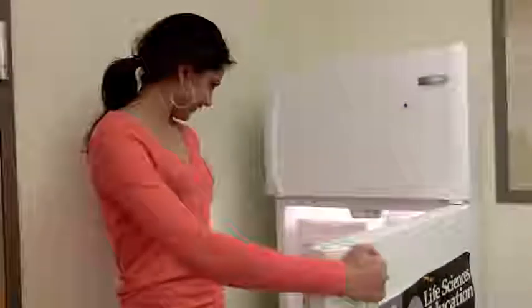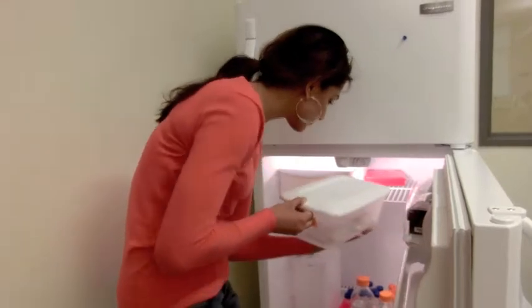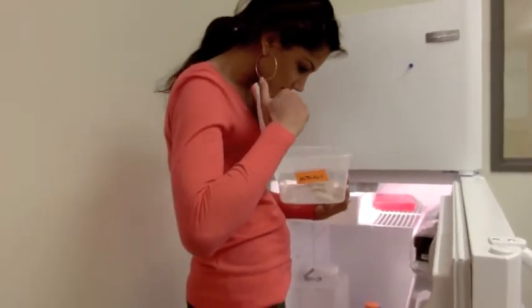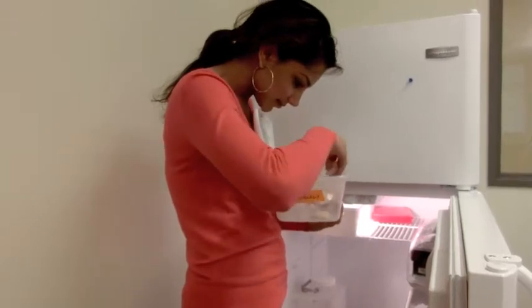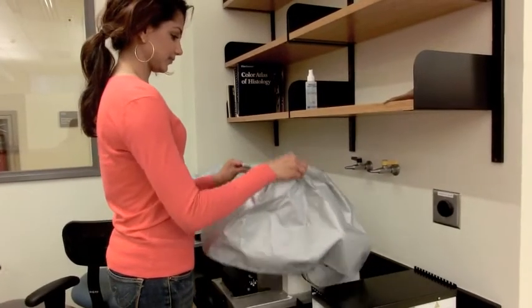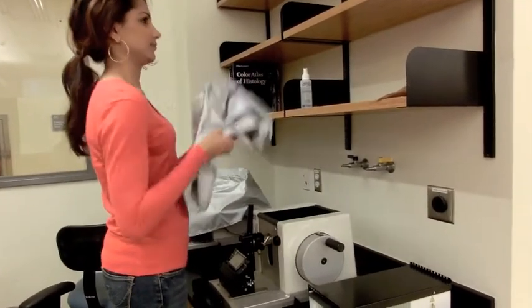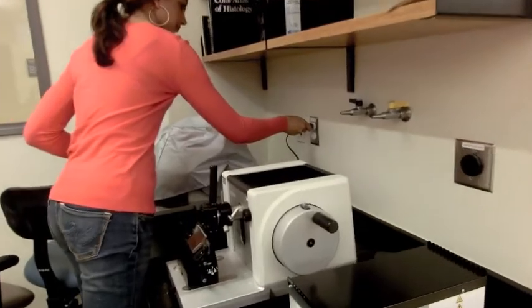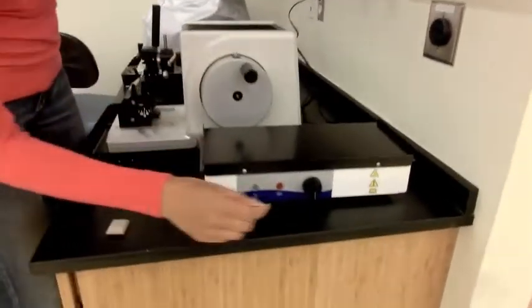Assuming you've already harvested and embedded your tissue samples in paraffin wax, obtain your paraffin cartridge from the refrigerator. Next, uncover the microtome. Next to this machine, you should find the slide warmer. Plug this in and adjust the dial to the middle position.